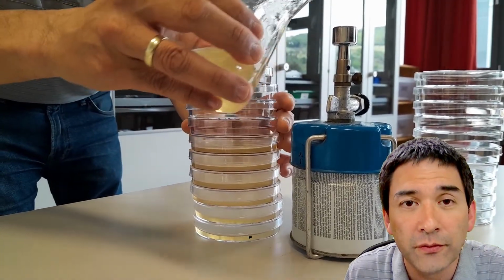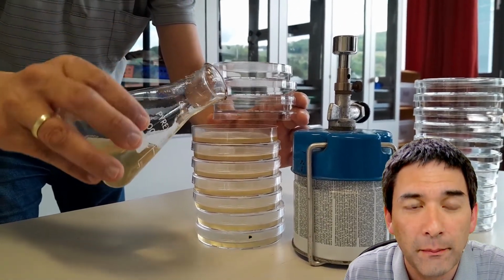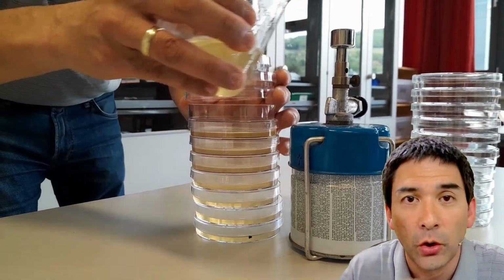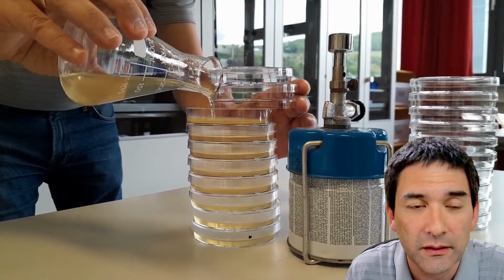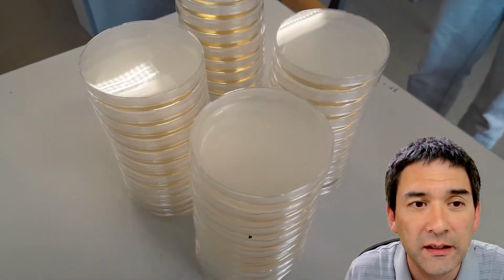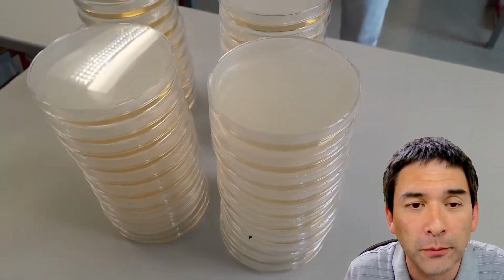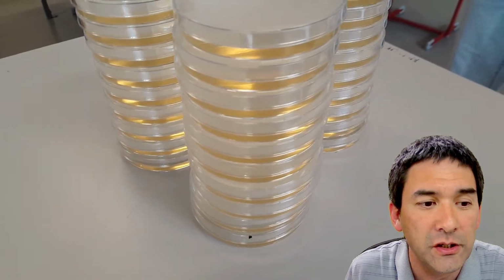Every time after I've done this, I've reheated the top part of the flask to prevent bacteria from falling in, because of this hot air cushion, so to say, that forms around the opening. And that's basically finished. Then you have to wait for a couple of hours for it to cool down, and then you can store it in the refrigerator, and that's pretty much it.